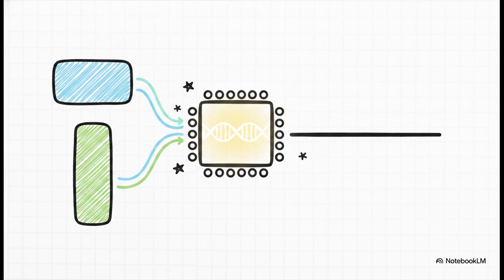The core equation here, k equals G times the cell constant, acts kind of like the DNA of the machine's software. It takes the raw conductance, G, and multiplies it by that cell constant. This brilliant little calculation normalizes all the data, which allows the measurement to be totally independent of the physical size or shape of the specific detection cell you happen to be using.